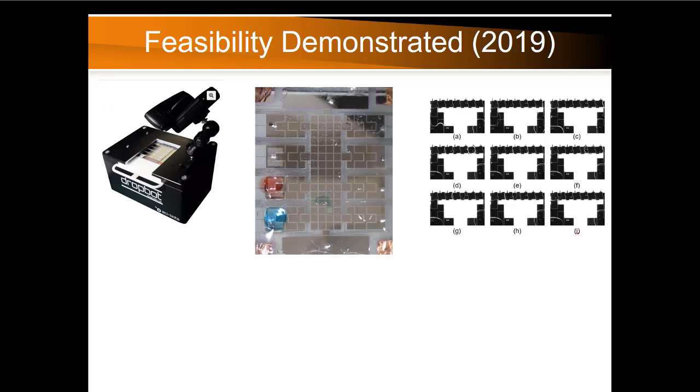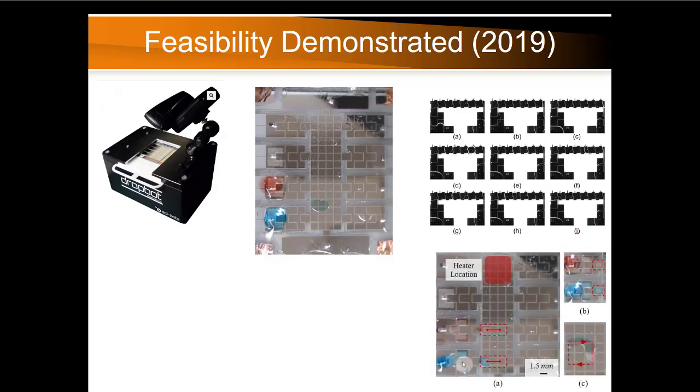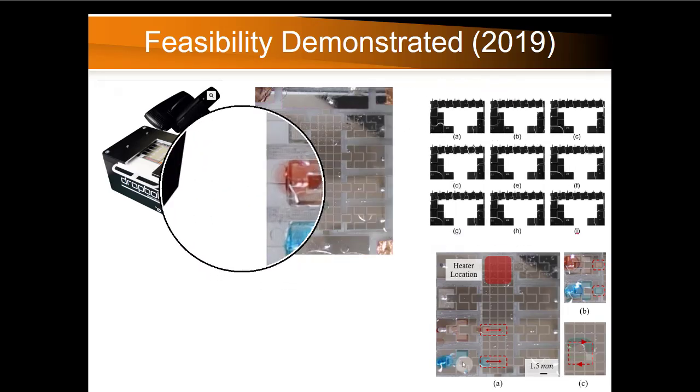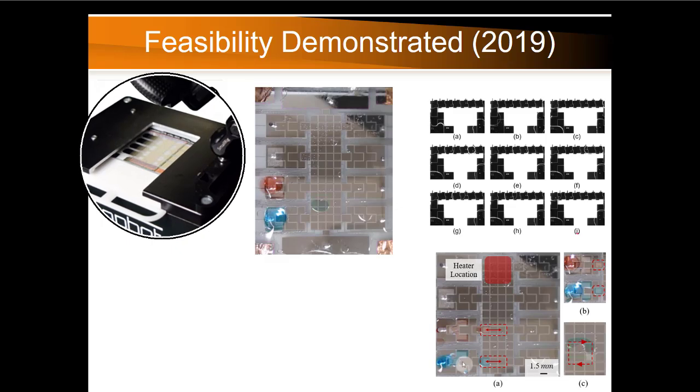So we've done this DNA ligation with droplets where the gap was filled with air. So that's in this particular figure. So these we're creating and mixing droplets in air. And this is controlled with not this DropBot system, but a National Instruments PXI box that we have. So that's more scalable if we need more than 120 electrodes. And then also, this DropBot system is made to move droplets around in air.